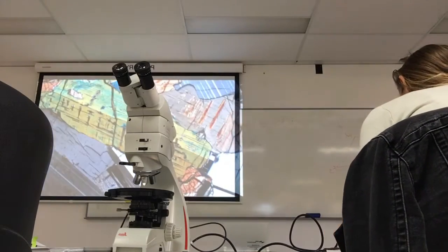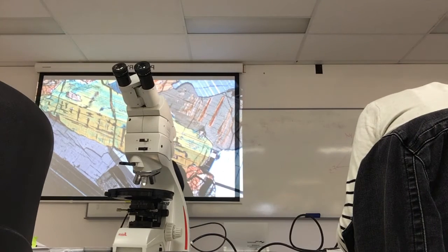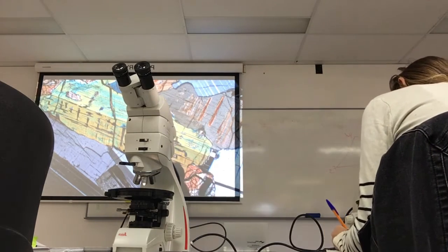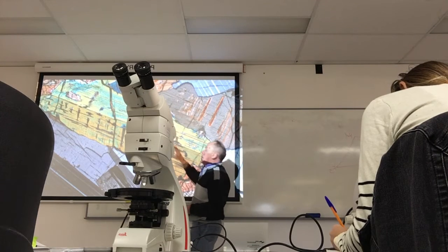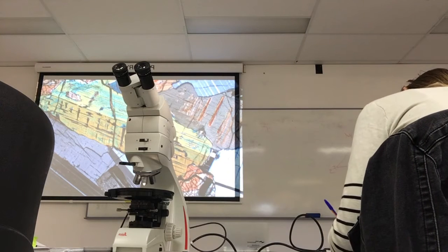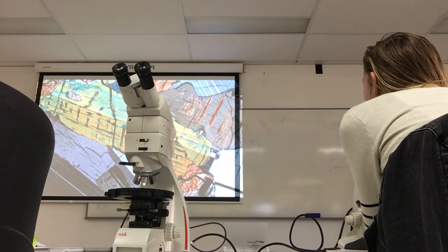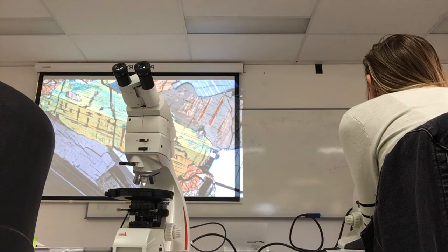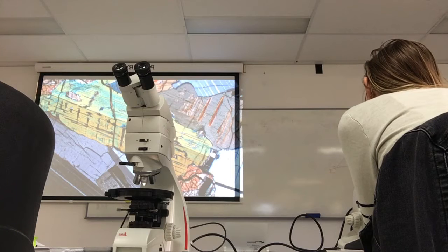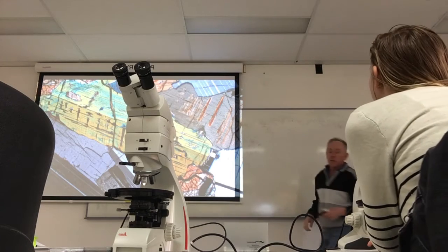Okay, so that's a clinopyroxene crystal. You've got a twin straight down the centre there. So the host, these bits here, are exsolution lamellae of orthopyroxene inside the clino host. So it started out as this subcalcic augite, this particular one. So the bulk composition of that grain is still there, but internally it's now got that as a host, and it's got exsolution lamellae of this inside it. You combine those two together in the proportions that you see on the screen there, and you end up here. So bulk composition same, but it's separated into phases.